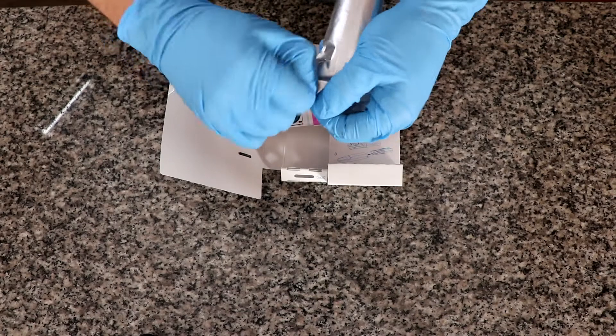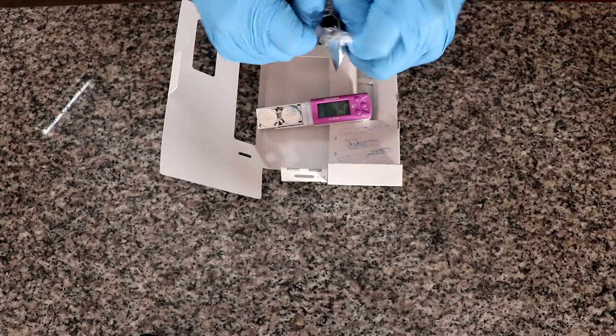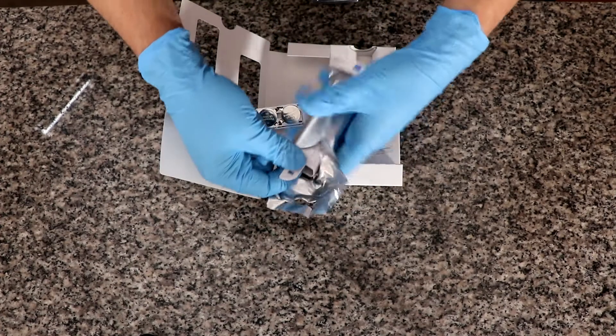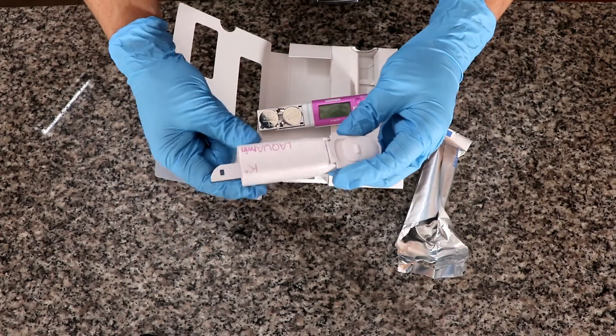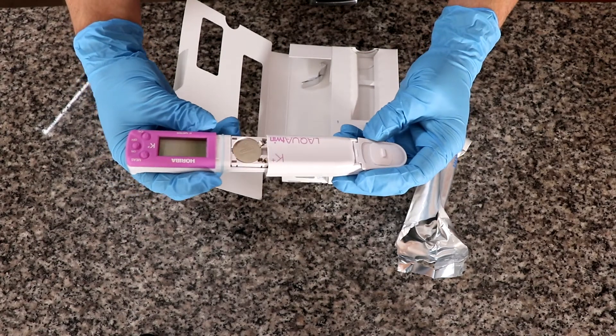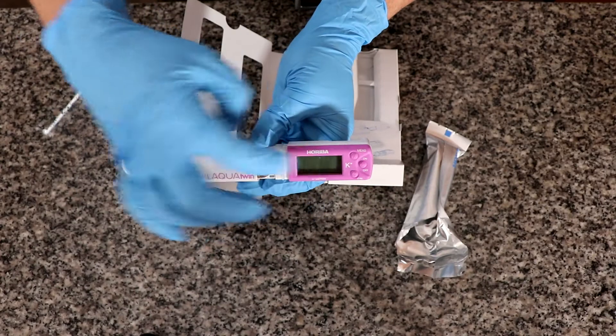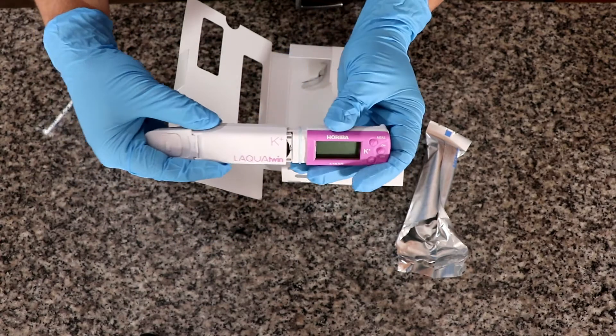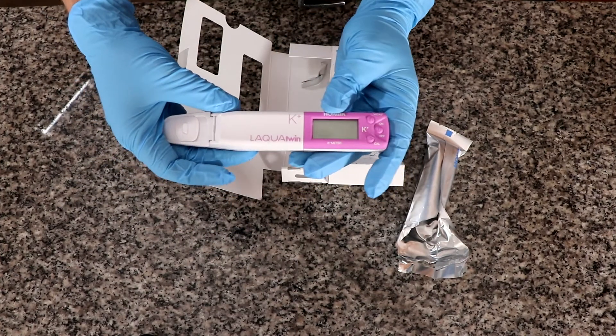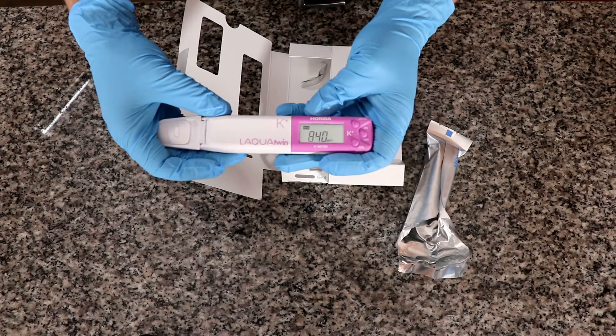Let's open this. This has a little thing here for easy opening and this is the electrode assembly. You can just make sure these letters are facing the same way and then you can just plug that in and this should just turn on now. You can see it turns on.